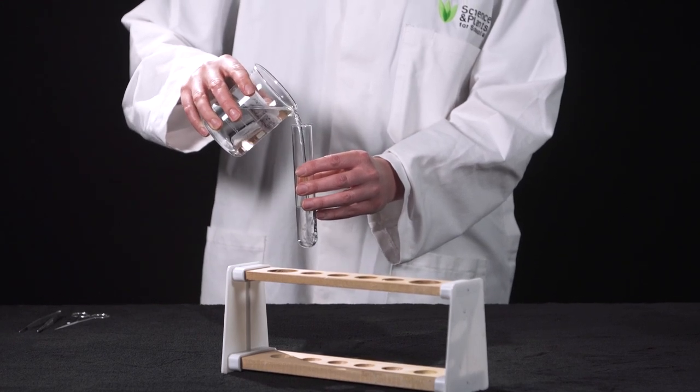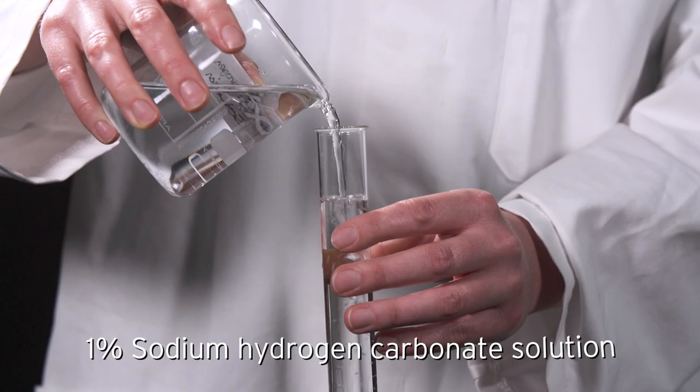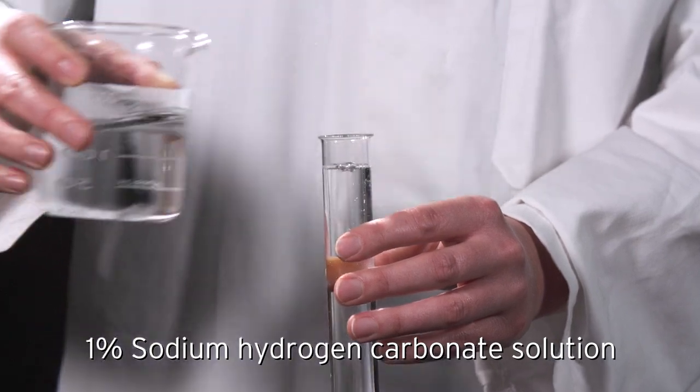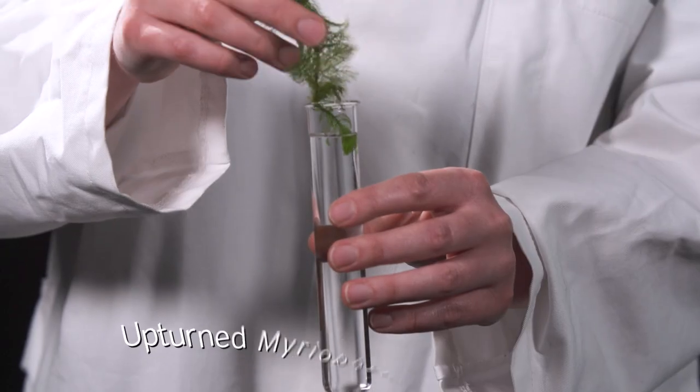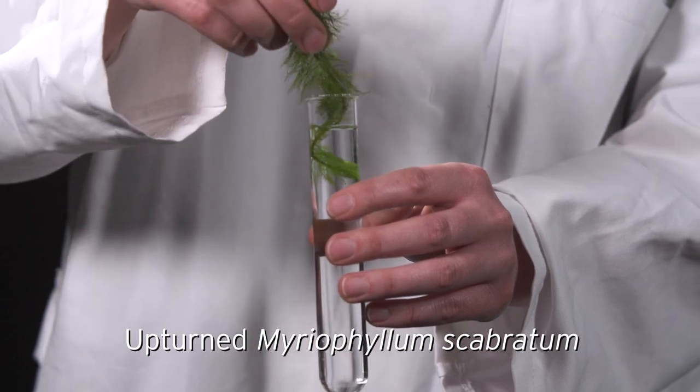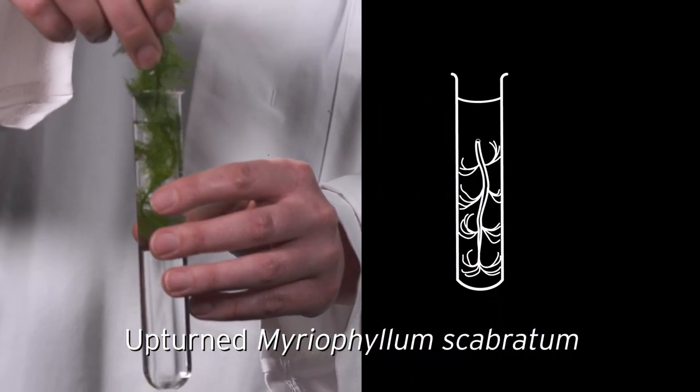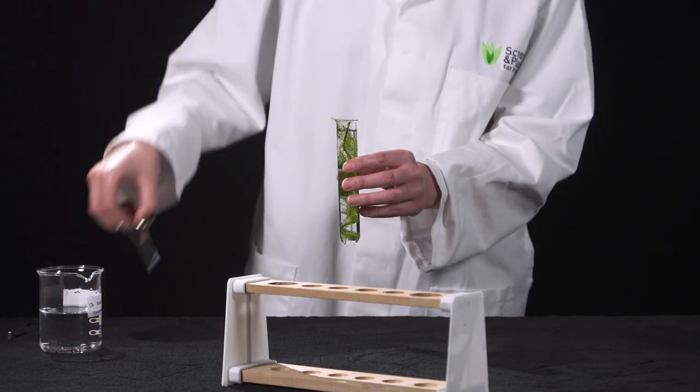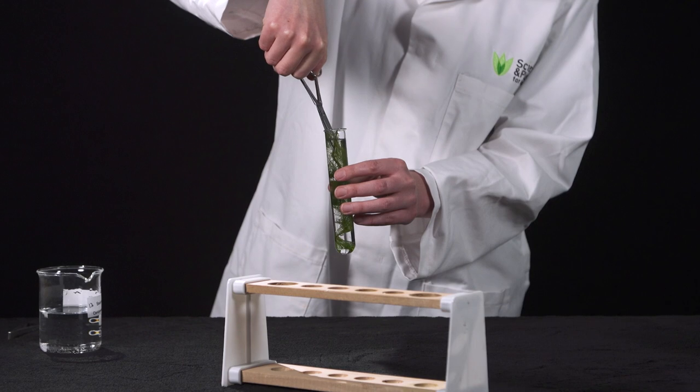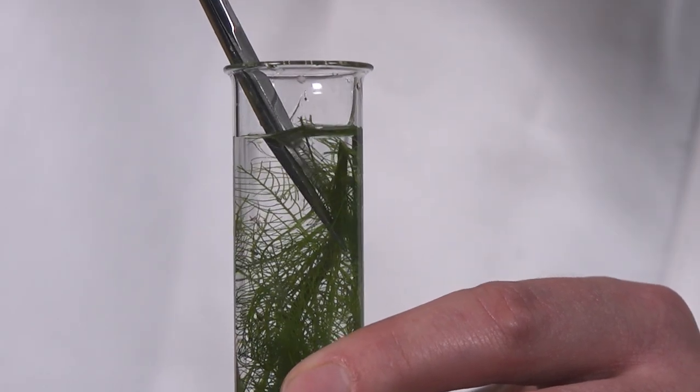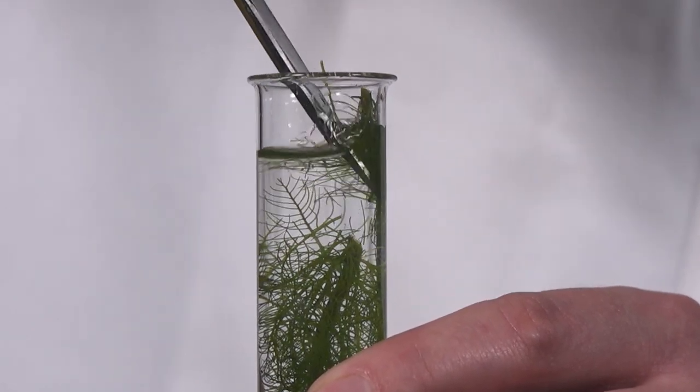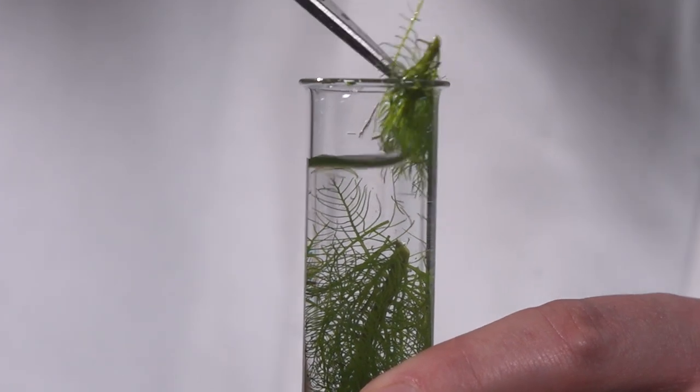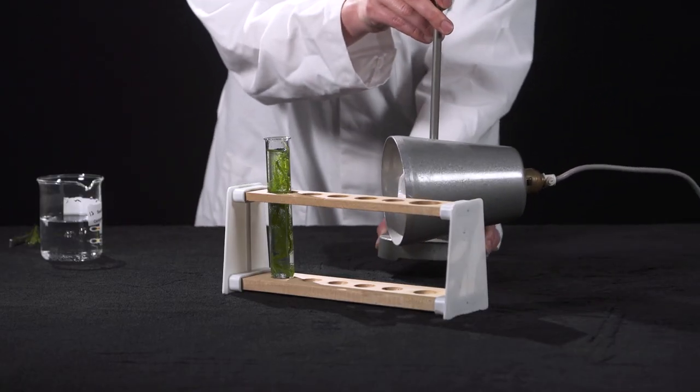The bubbling pondweed setup is versatile and can be used in different ways for different groups of students. It can be set up by simply filling a boiling tube with 1% sodium hydrogen carbonate solution, and placing a piece of pondweed in it, cutting the stem under the level of the liquid. Cutting the stem at an angle under the surface of the liquid is important because it stops an airlock from forming, which would stop bubbles from being able to escape.